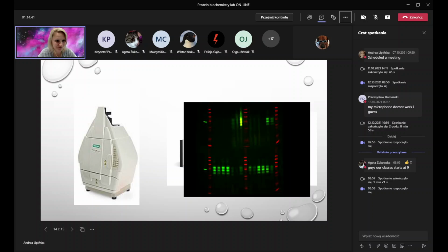So the question is, if you have questions, just think about them. I hope our Western blottings go well, so the transfer is sufficient. How can we, for example, estimate the efficiency of our transfer? Of course, there are at least two ways, or three ways that I can think of.